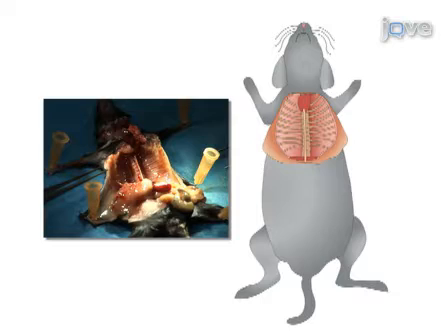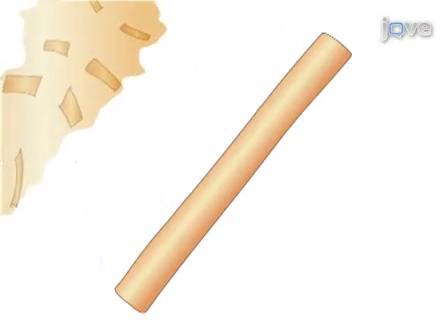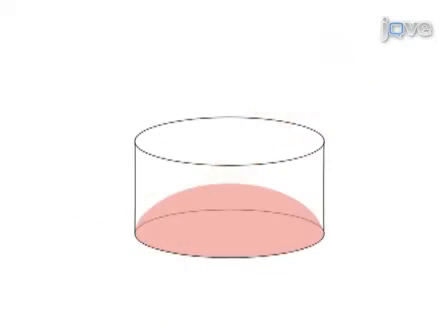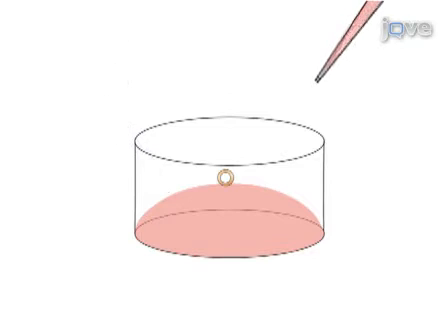This is achieved by first dissecting the thoracic aorta out of a mouse, and then carefully cleaning it of any leftover surrounding tissue. Slices of the cleaned aorta, or aortic rings, are placed into individual wells of a 48-well plate, each holding basal matrix extract, or BME, molded into domes. An extra drop of BME encloses the ring in a 3D structure.